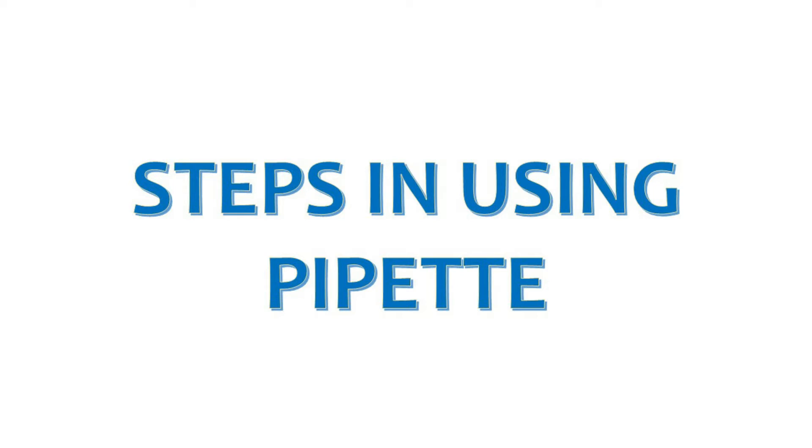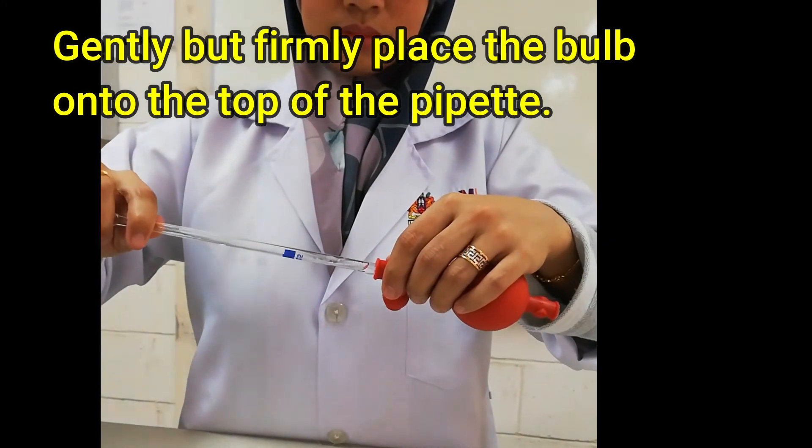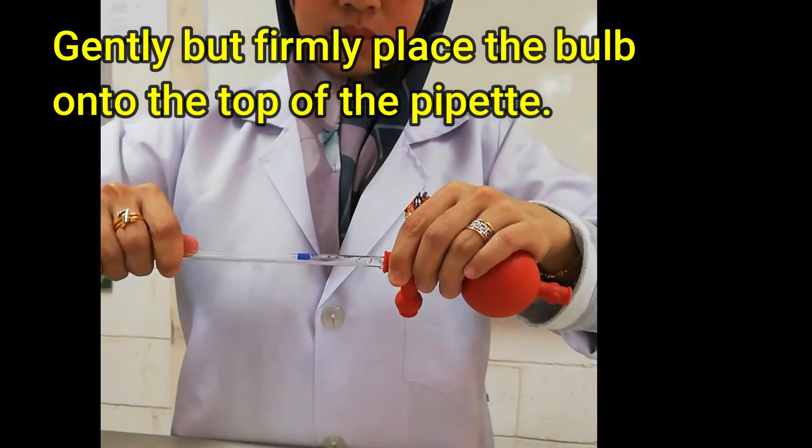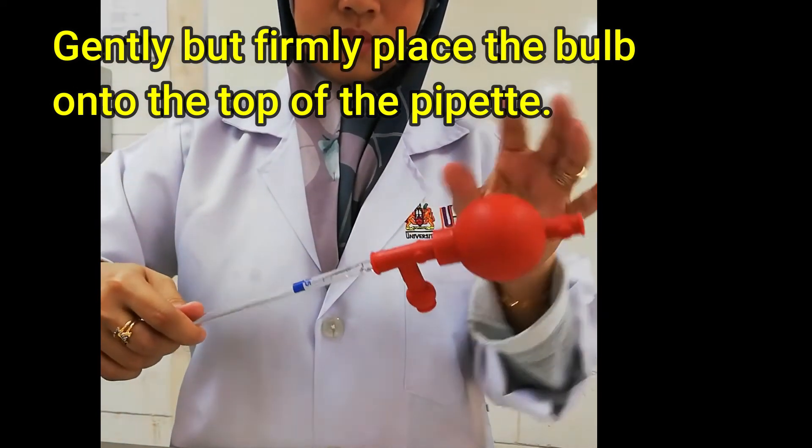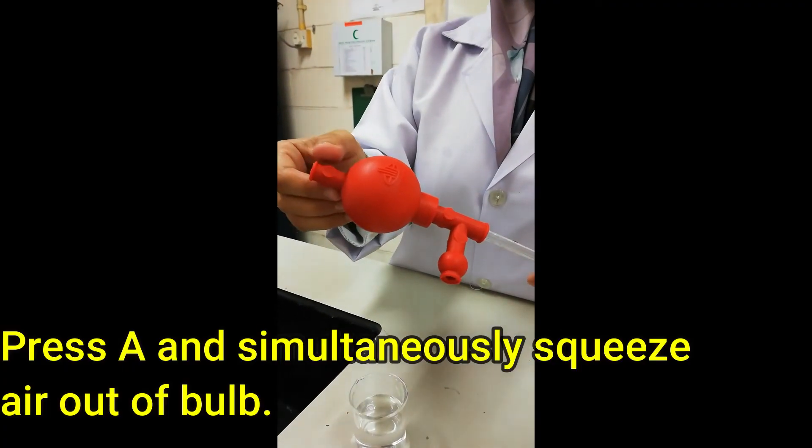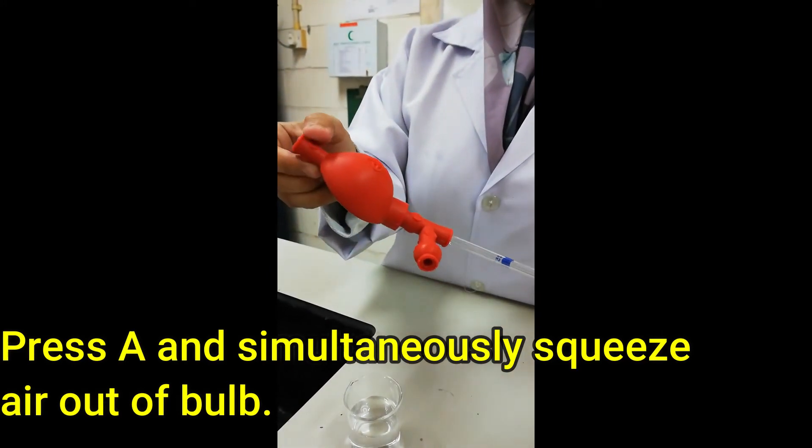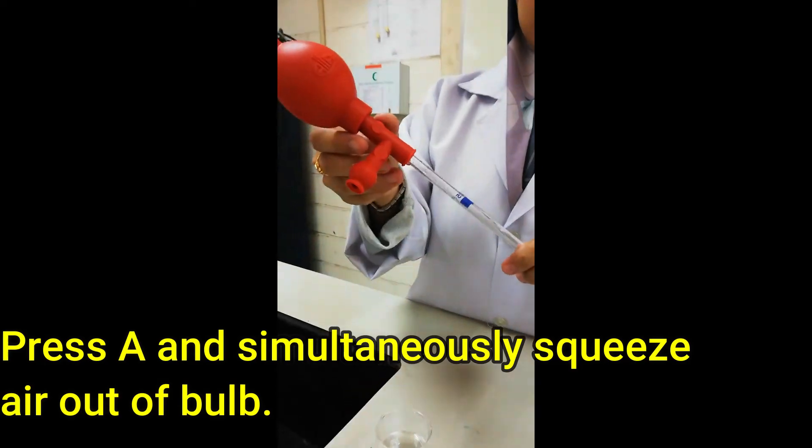Steps in using a pipette. Step 1: Rinse the pipette with distilled water. Gently but firmly, place the bulb onto the top of the pipette. Press A and squeeze the bulb simultaneously to release the air out of the bulb.